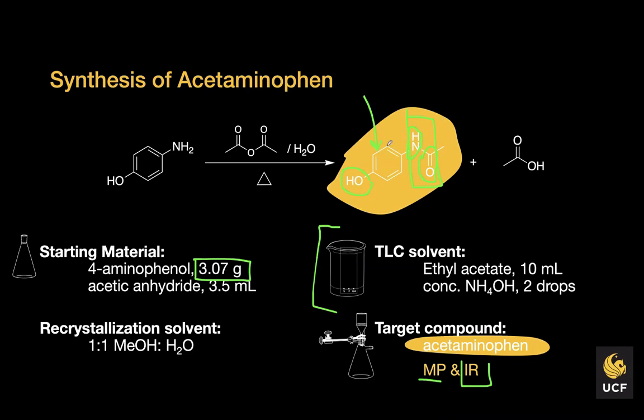And then we have the hydrogens attached within the benzene ring if you end up identifying those, and we have the sp3 hydrogens right here. So those are the different things that you're going to be looking at in terms of IR. So the PowerPoint, I don't post it online, but I do post this video later for you.